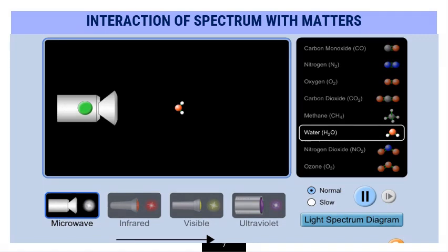In this video, we're going to talk about spectroscopy, which is all about the interactions between light and matter. And when we're talking about light, we're not just talking about visible light. We're talking about electromagnetic radiation in general. And so what I'm going to do to give us an intuition here is use the PhET simulator by the University of Colorado. I encourage you to go to this URL and try it out for yourself.